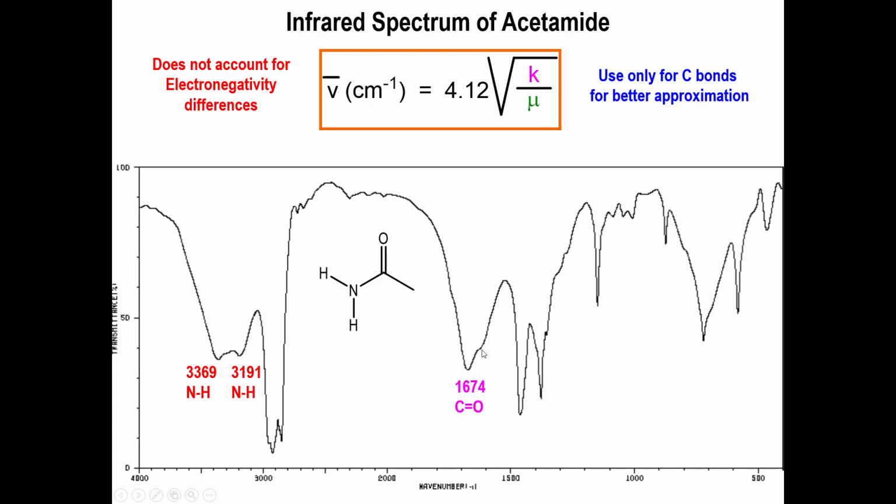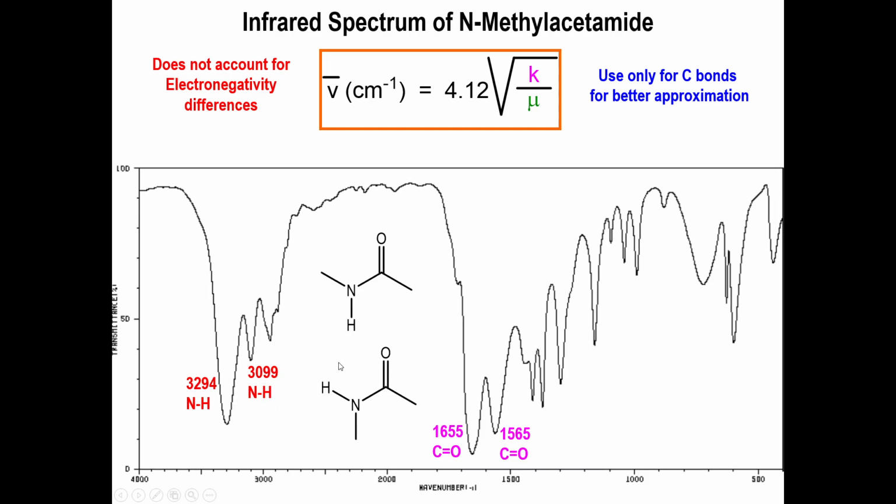And if the nitrogen of the amide has hydrogens, you will see those broad peaks above 3000. In the case of two NHs, usually, not always, but usually you see two peaks above 3000, which are both broad by default. If you only have one NH, then typically you only get to see one peak.